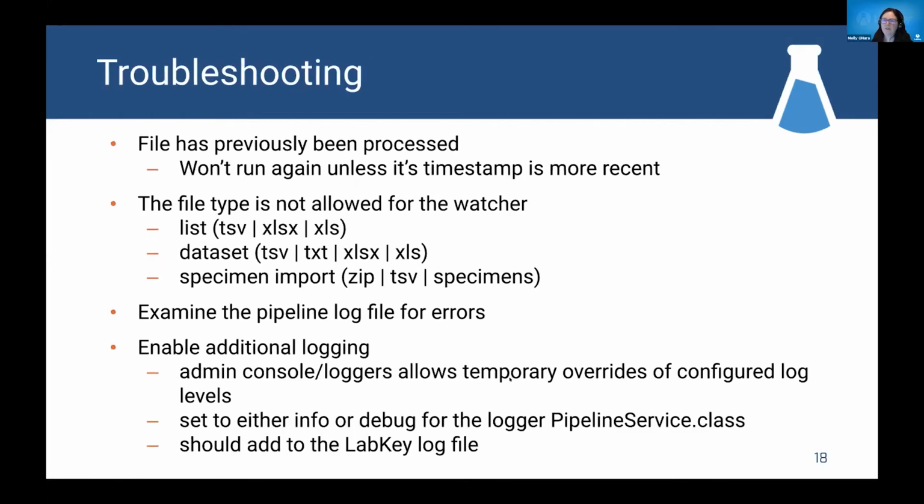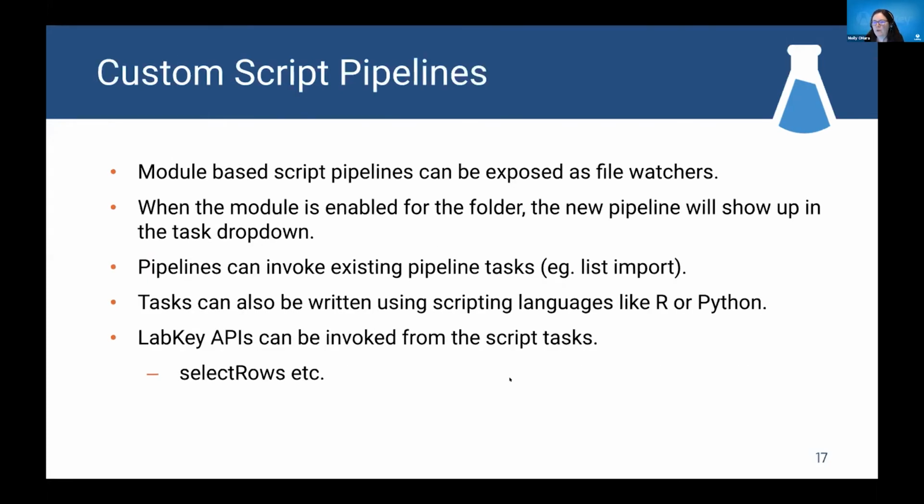Hi, Karl. I wonder if I can jump in with another question that came in as we're getting close to the closing. You mentioned when script pipelines were added, but when did file watchers become available? Oh, you're testing my memory. I have the answer offhand if you need it. Yeah, I thought it was in 2017. Yep. So a couple years ago, 3 years ago. Thanks. And we're at about 3 or 4 minutes.